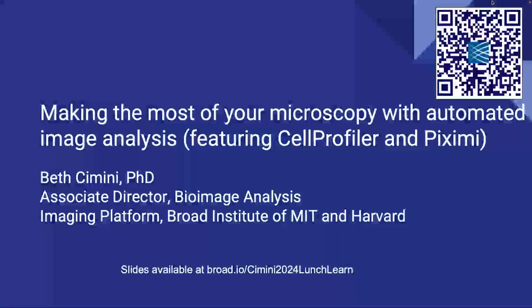Just a question: who has taken an image on a microscope before? Most of the folks. Who has done some sort of image analysis on that image before? Just about everybody. Put your hand down if it's not Fiji. Okay, yeah. So most folks, again, all of us start with Fiji, including myself, and Fiji is great. It's still the absolute first thing that I use when we get new images in the lab. But I'm going to tell you about some of the tools that our group writes, which, once you've done your initial image exploration, will hopefully make your life a little bit easier in terms of creating quantitative analysis, especially high-throughput quantitative analysis.